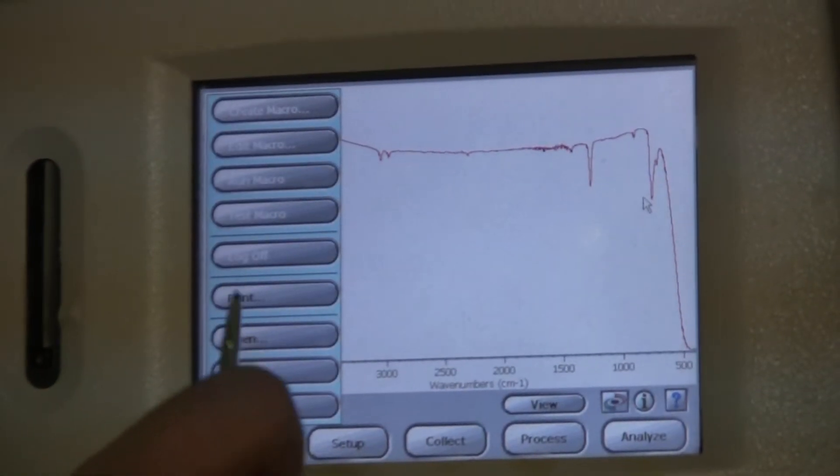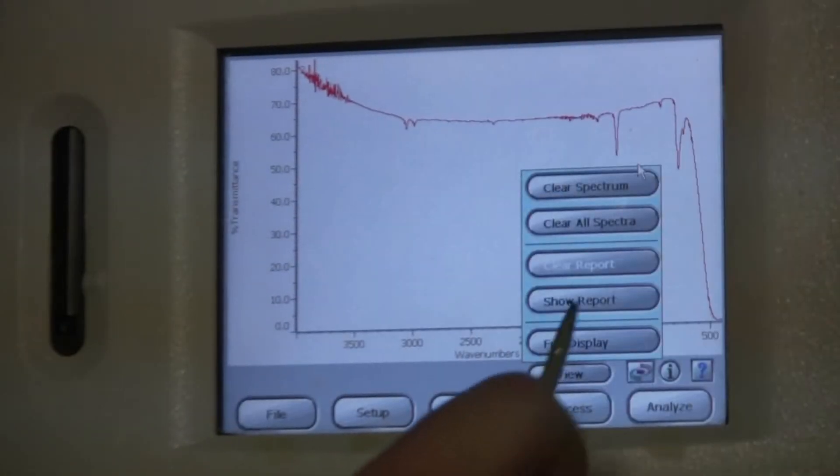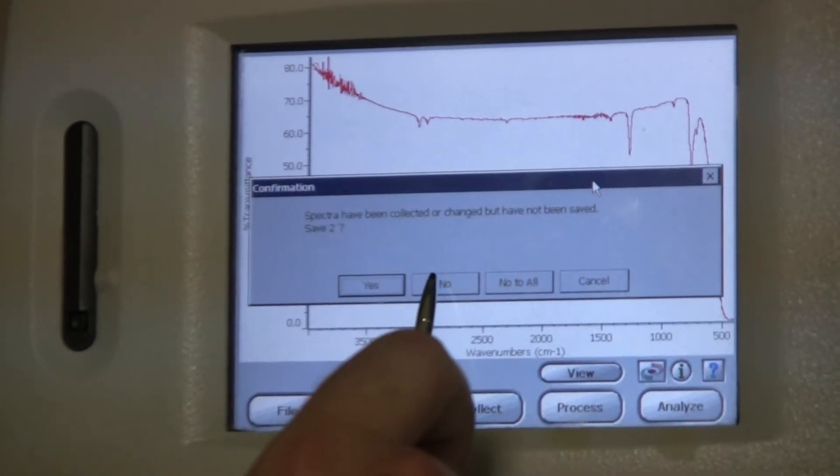To print, go to File, Print, and then click OK. To clear this screen, go to Process, and Clear Spectrum, and then click No.